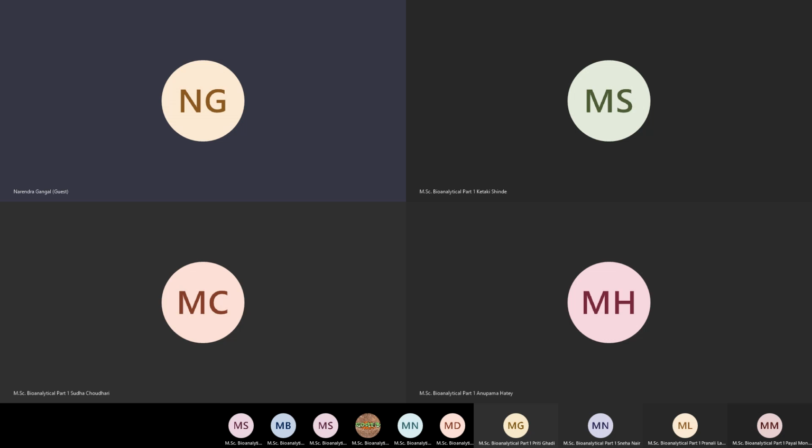Whereas in the case of chalk, if it becomes powder, no trace of the original chalk piece is seen. Only a fine powder will be seen, meaning only small fragments, from which I may not be able to elucidate the structure, because I will always need fragments and the molecular ion.